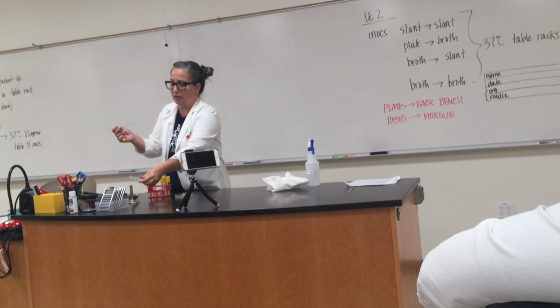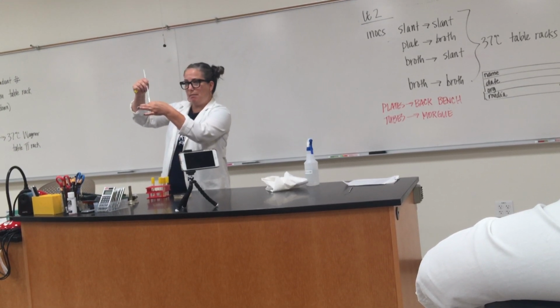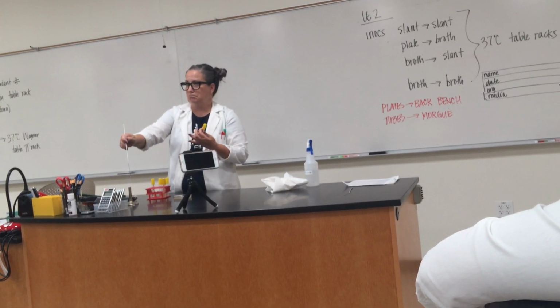If I'm going into a broth, I do this, and I just give it a little tap, tap, tap, and wave it back through, close it, and sterilize it.